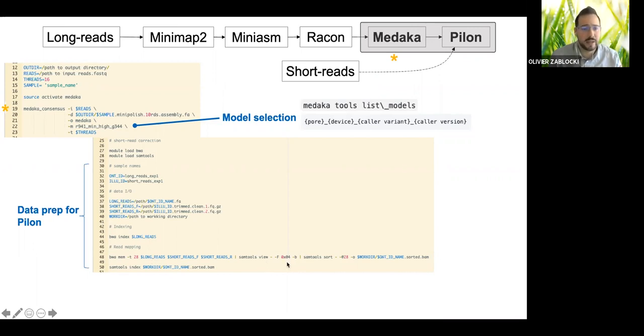And this line here, this code, actually removes all the reads that were not mapped, so that you reduce the footprint and the size of the BAM file. I've made this mistake myself. And when you don't use this very intelligently, you have a BAM file that's 20 gigs in size, and you just can't handle it further downstream.